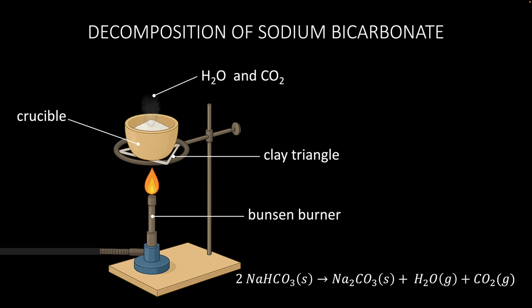This will decompose the sodium bicarbonate into sodium carbonate, which is already present in the mixture, water, and carbon dioxide. The law of conservation of mass says that mass is always conserved in any chemical reaction. This means that the total mass of the reactants must equal the total mass of the products.